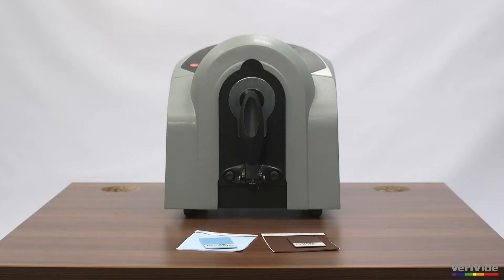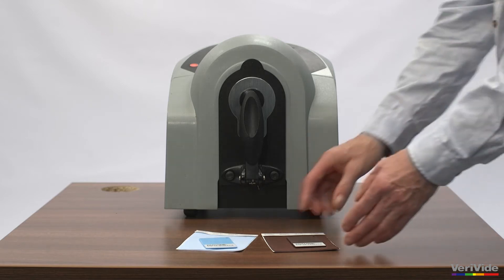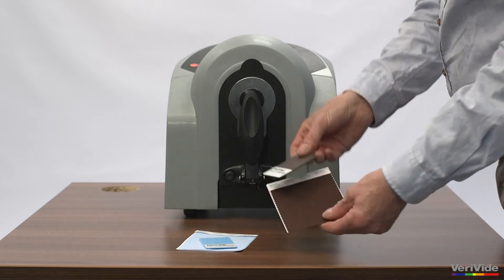A benchtop spectrophotometer is an accurate instrument for measuring colour of flat samples, such as plain fabrics and plastics.